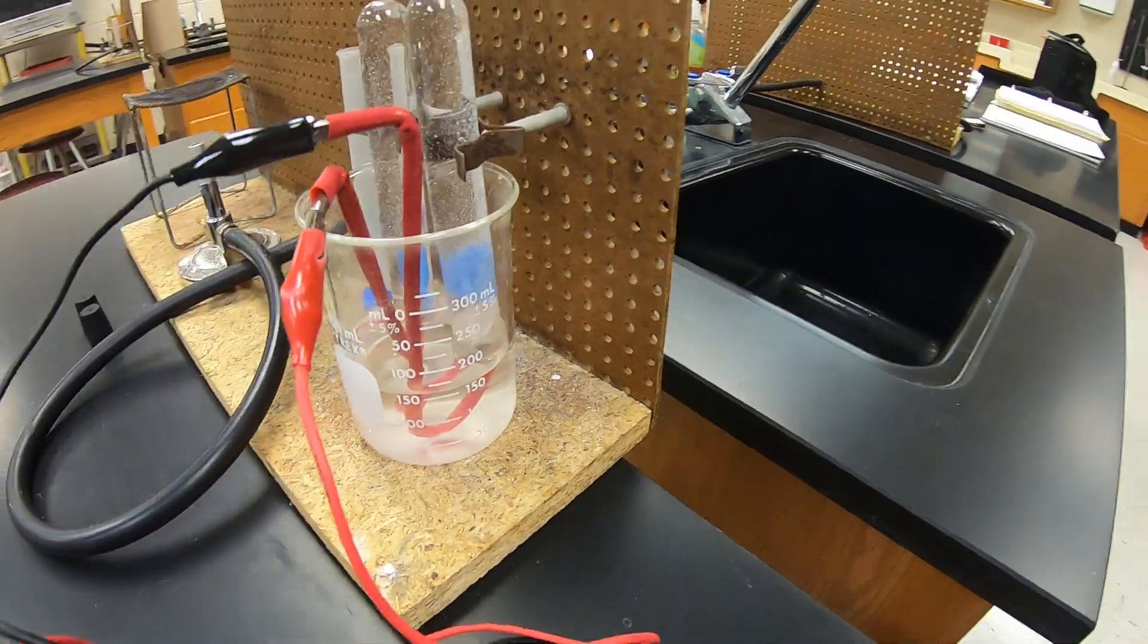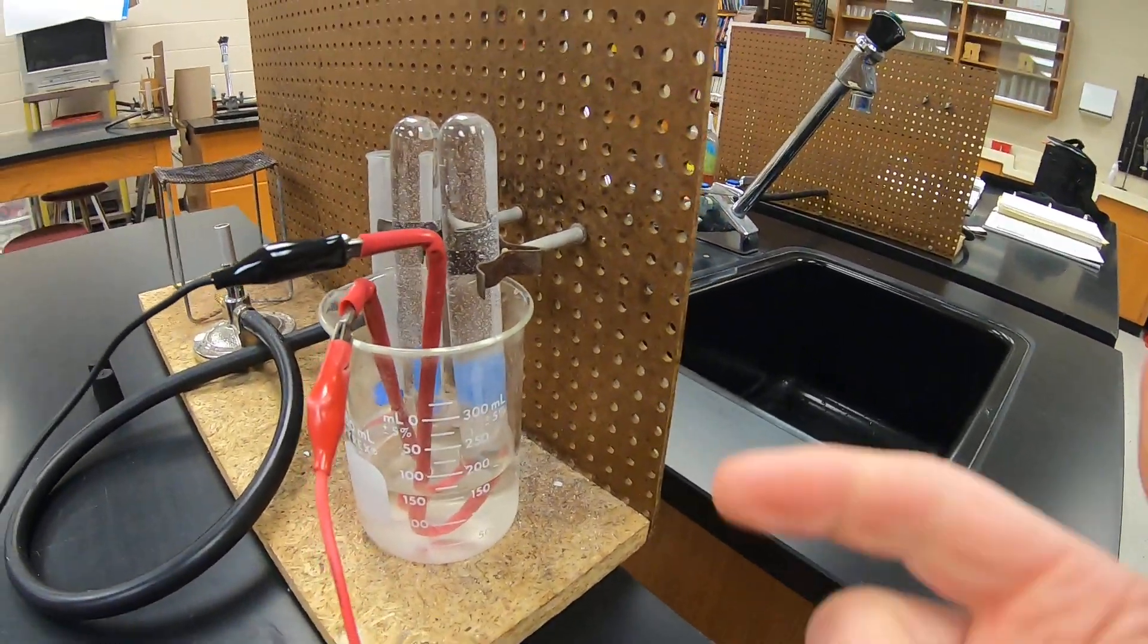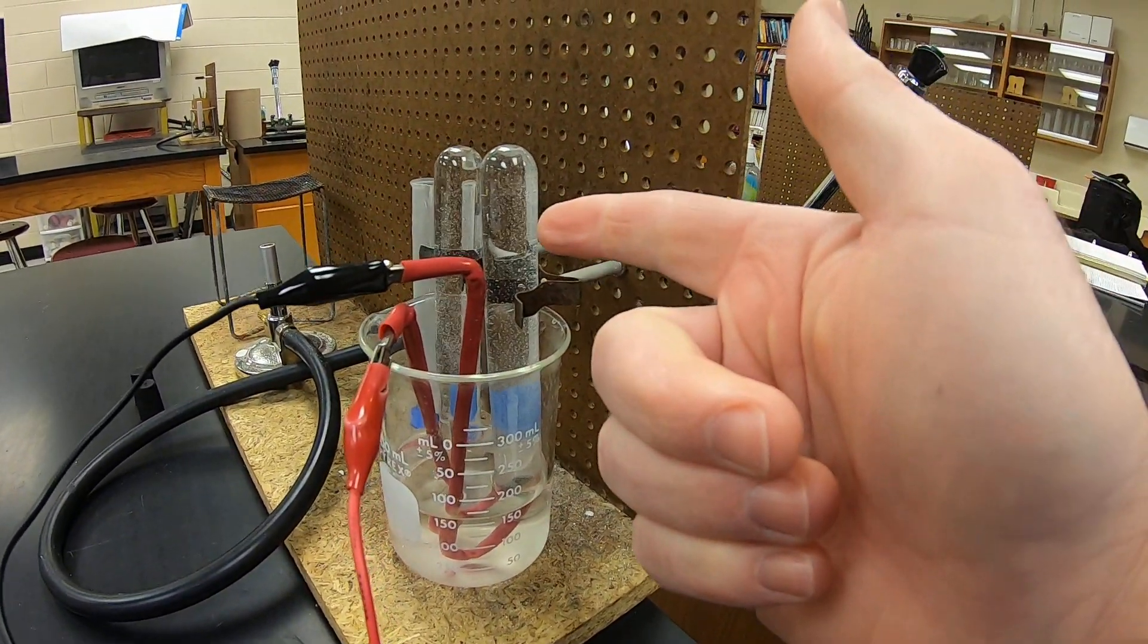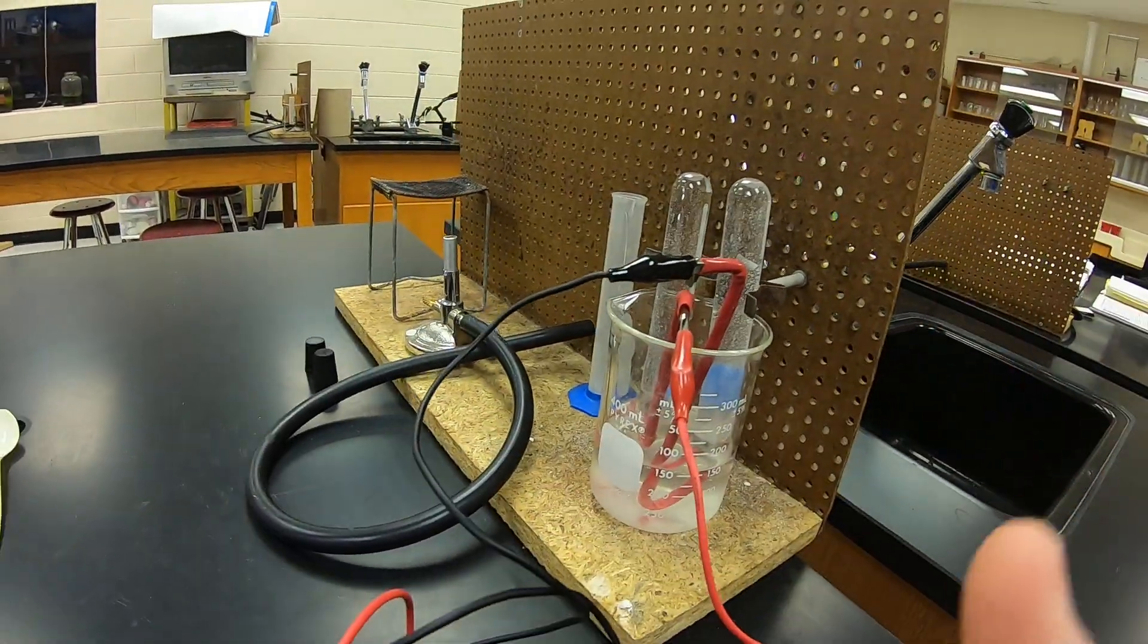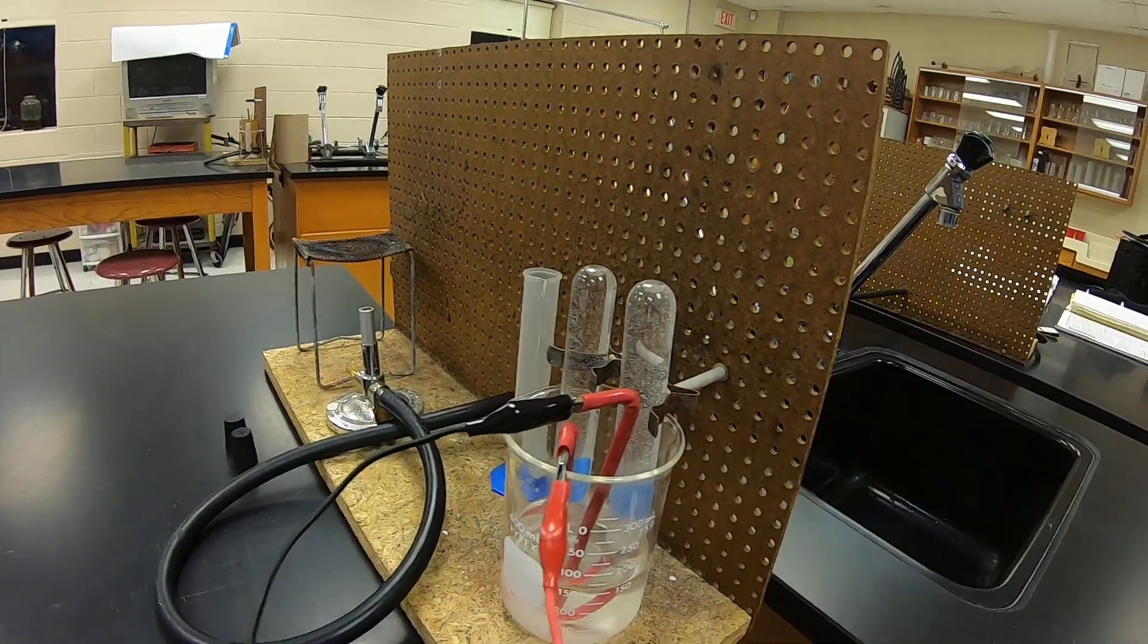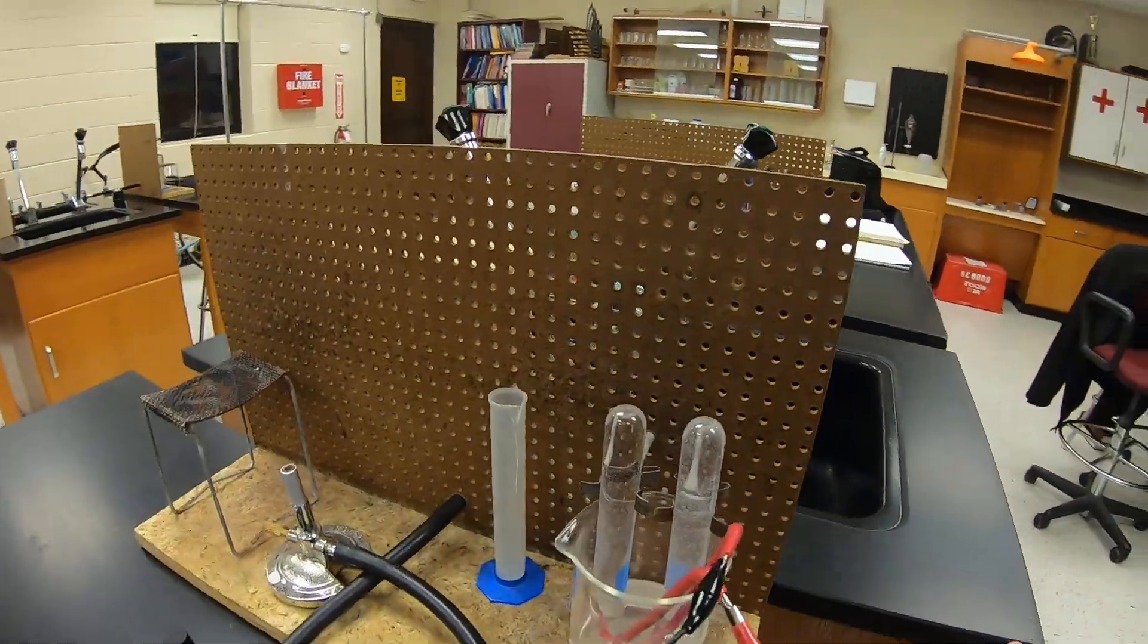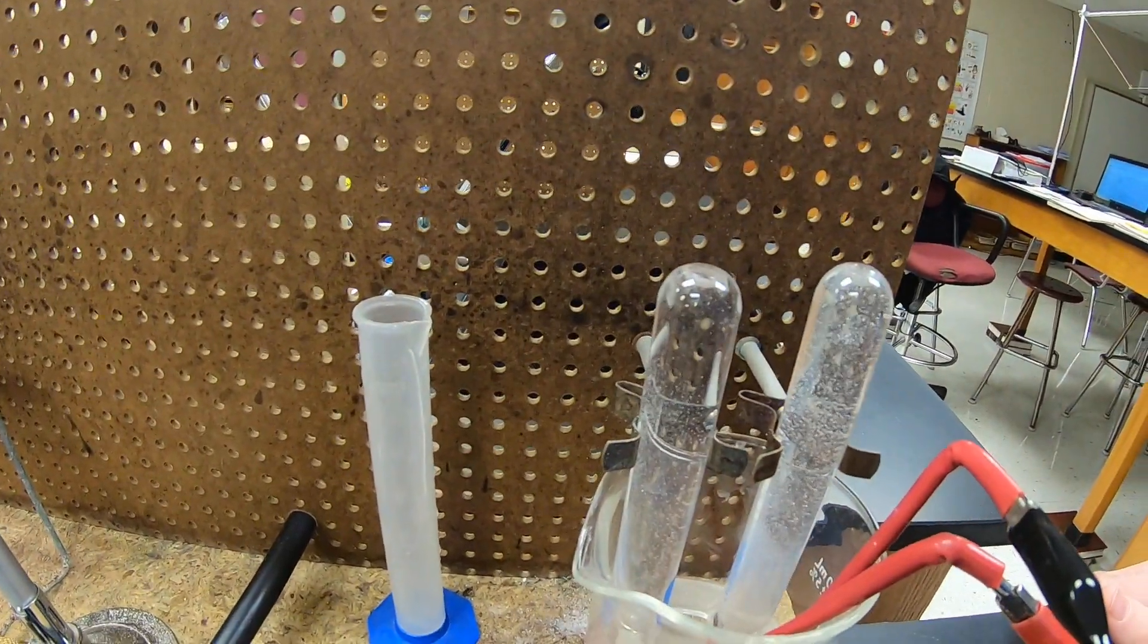And one thing that you'll notice, I'm not sure how well you'll see it on the video, but this side over here, the negative electrode, the black wire, is going a lot faster than this side over here with the positive electrode.